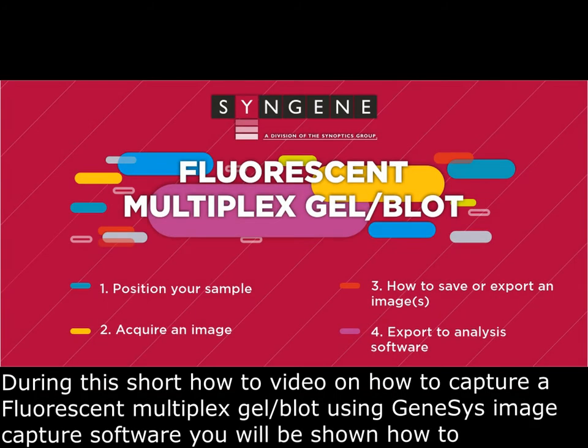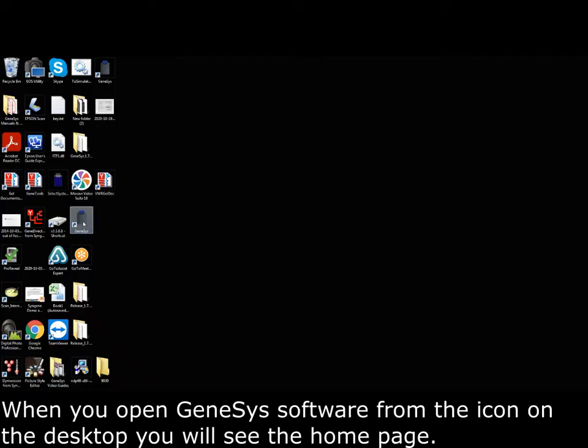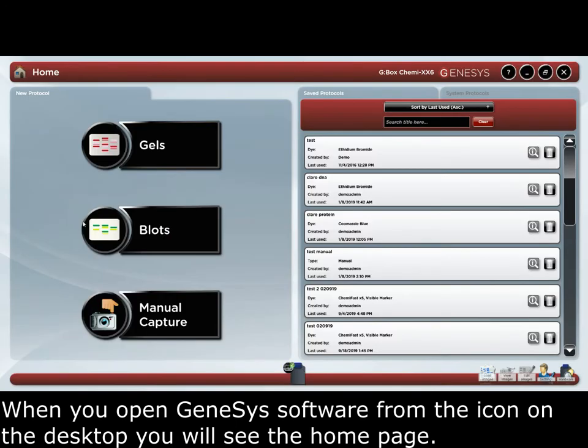Short how-to video on how to capture fluorescent multiplex gel or blot using GeneSys image capture software. You'll be shown how to: 1. Position your sample, 2. Acquire an image, 3. Save or export images, and 4. Export to analysis software.